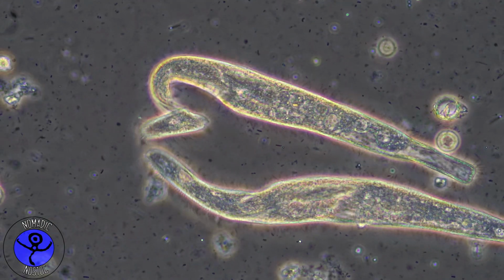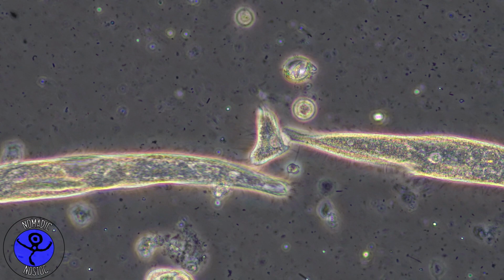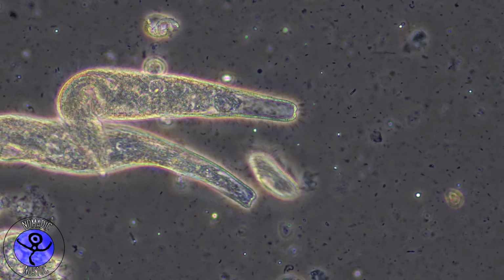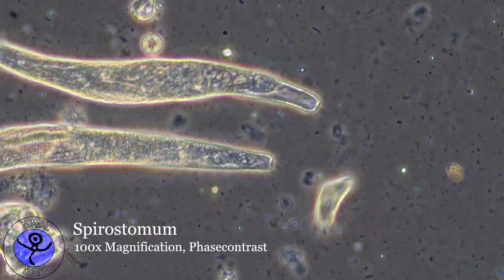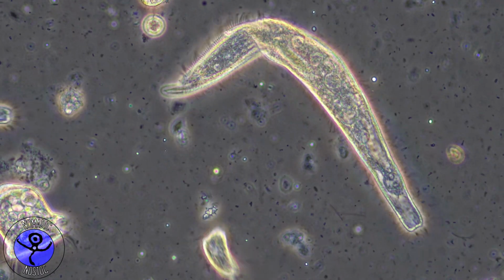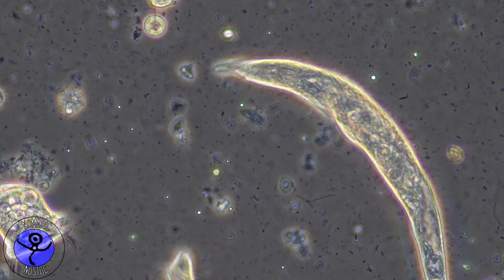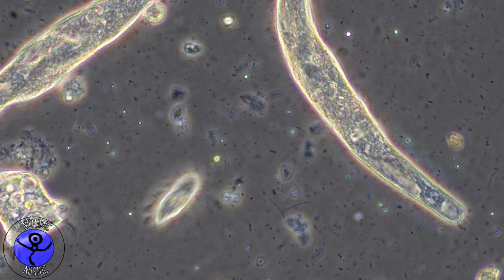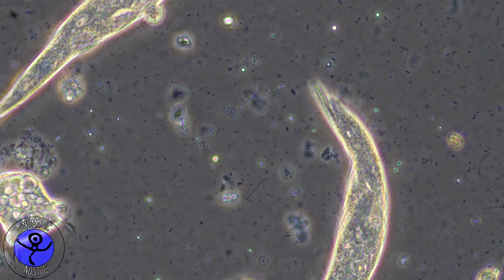I have no idea what might have caused this injury in Spirostomum. However, its reaction to it is very interesting. It uses its ability to contract rapidly to dispose of it. And once it managed to detach the head part from its cell, the head part swims away and develops a life of its own. I have no idea if it is able to regrow Spirostomum from body parts, but actually there are other microbes that can do that, namely Stentor. Stentor is able to regrow itself from pieces. Maybe Spirostomum is able to do the same.